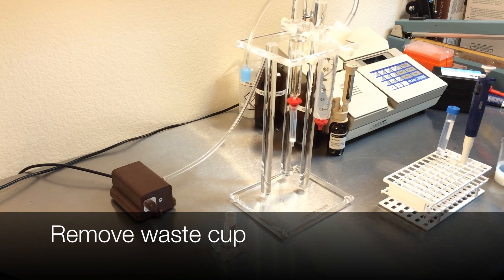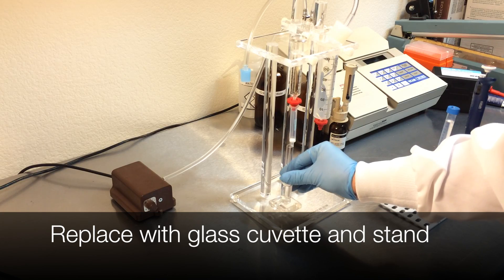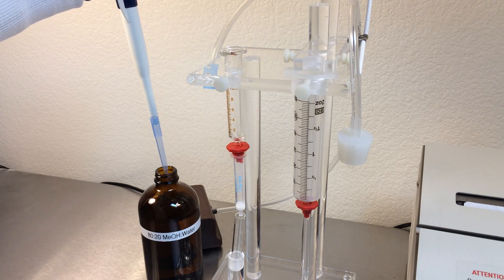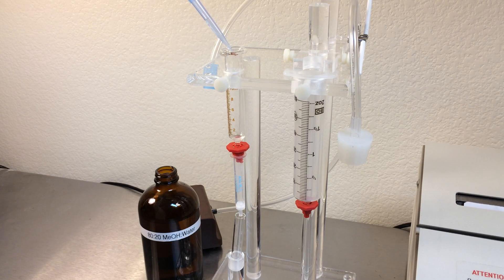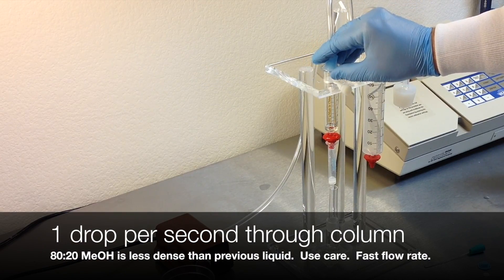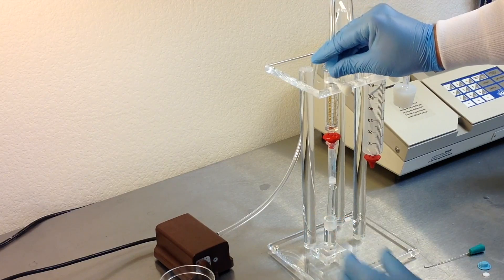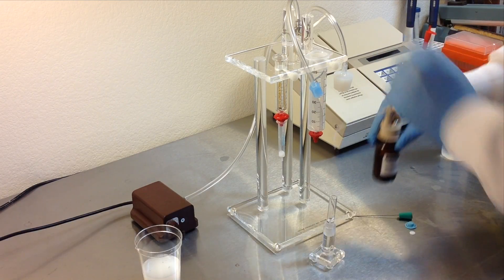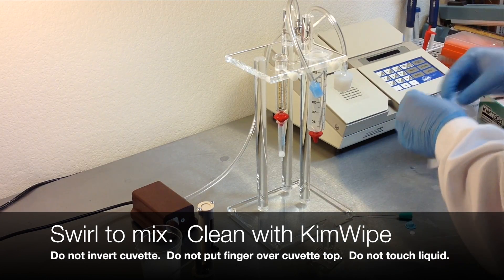Remove the pressure and replace the waste collection cup with a new clean cuvette. Elute the column by passing one milliliter of 80-20 methanol at one drop per second through the column. This mixture of methanol is much less dense than the standard water solution, so be very careful as you pass the air through — it will flow very quickly. Add one milliliter of Aflatest Developer directly to the cuvette, swirl to mix, then clean with a Kimwipe and place directly into the Vicam fluorometer.